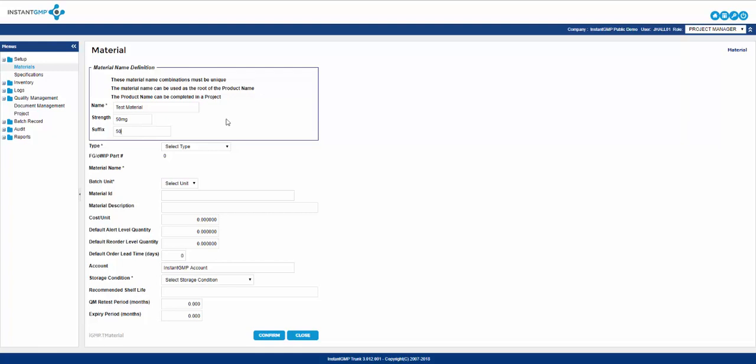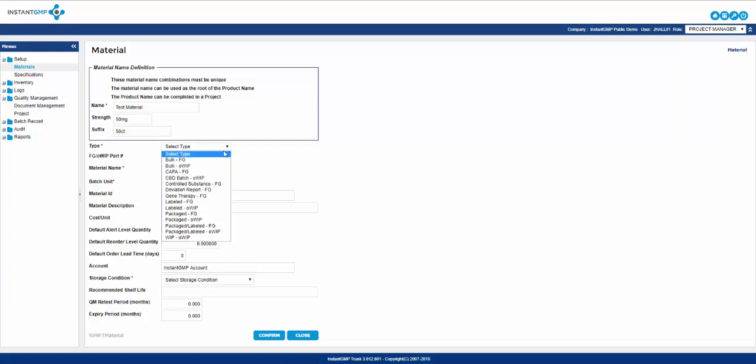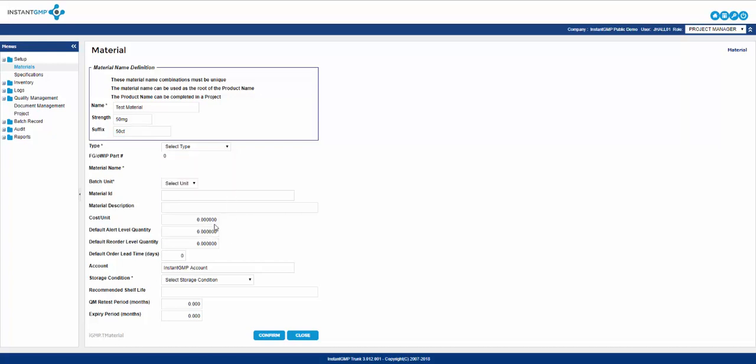The system will present an error if there is a duplication of products. Type allows you to choose the type of material this product is. Is it a bulk OIP, bulk final good, packaged OIP, packaged final good, etc.